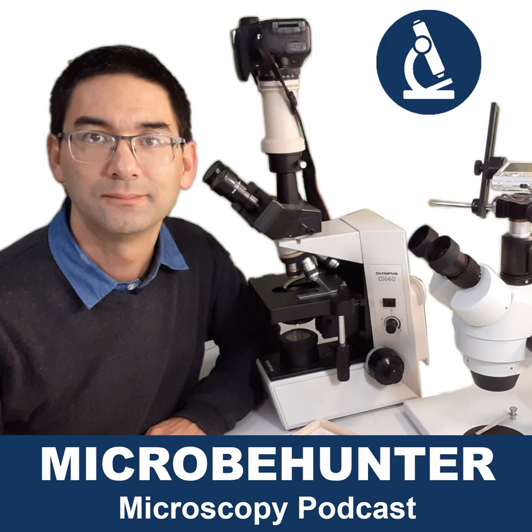Now, if you still want to increase the color contrast somehow, then you have to use something that you call optical staining techniques by use of filters. And this kind of leads me over into the third point, and that has to do with the refractive index. Sometimes, even if objects are not stained, and if they're clear, if they have a different refractive index, you can still make them visible by using the so-called optical staining.